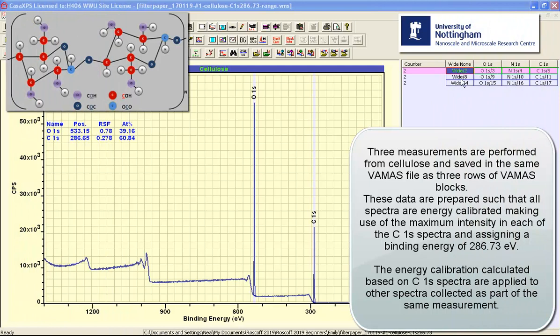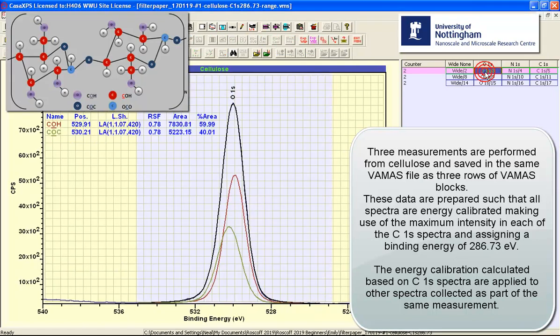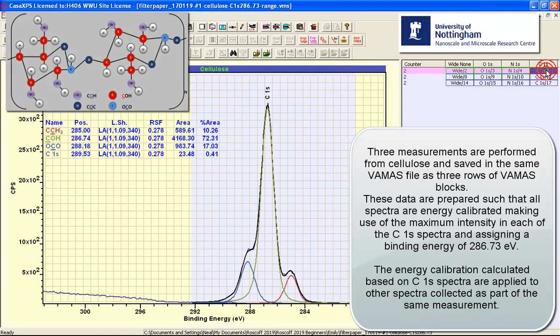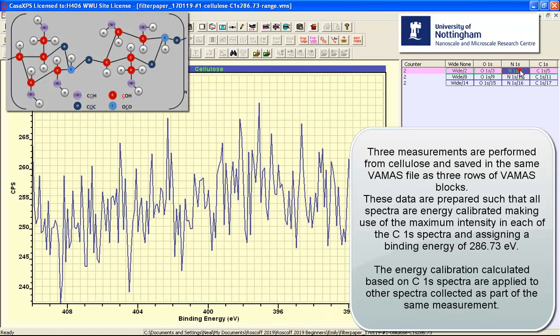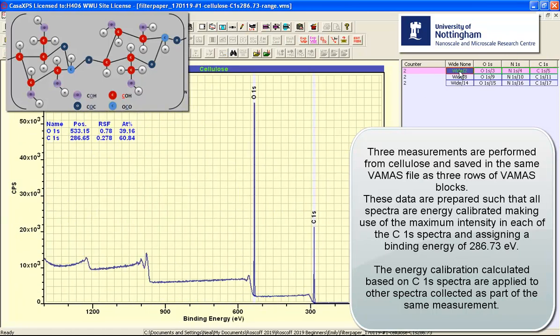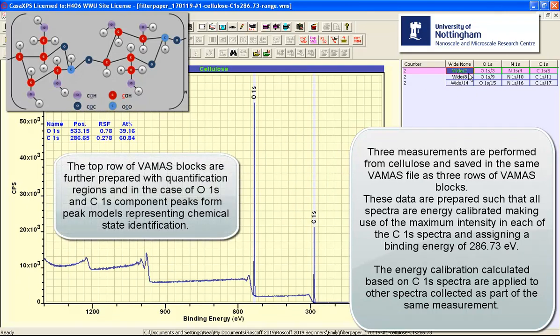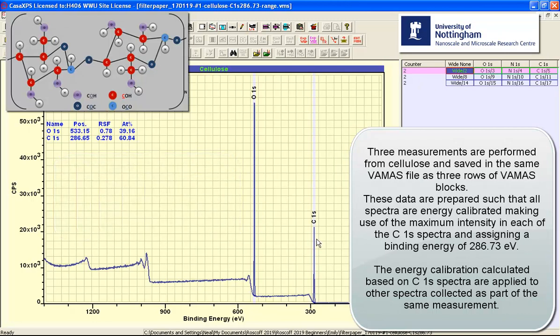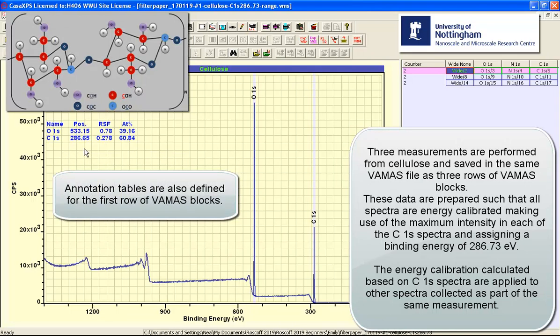This FAMAS file contains three measurements from cellulose and each measurement represents a survey measurement, oxygen and carbon. There is nitrogen but at very low concentration, so the spectra of interest have been prepared for the first row representing one measurement with a pair of regions on the oxygen and carbon, and there is a quantification table.